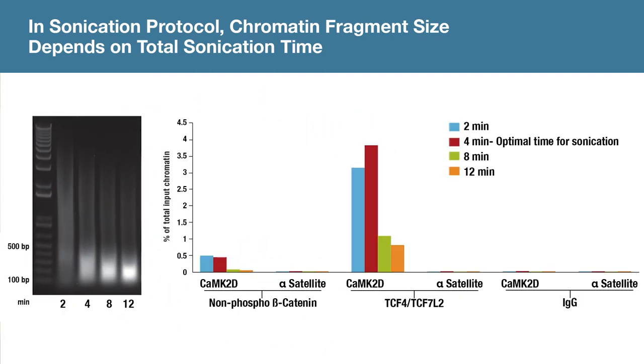However, when we look at target enrichment using these chromatin samples, 4 minutes of sonication provides the optimal level of target enrichment. More interestingly, you can see that over-sonication is even worse than under-sonication.